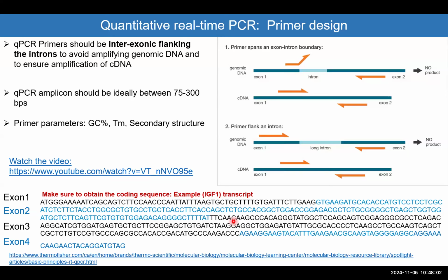The bottom line, I'm not going to ask you about those combinations. The bottom line for me, I want you to understand how you design the primer. So if I give you 2 exons, I want to know where you design the primer. I'm not going to give you the combinations of 7 exons. Okay.